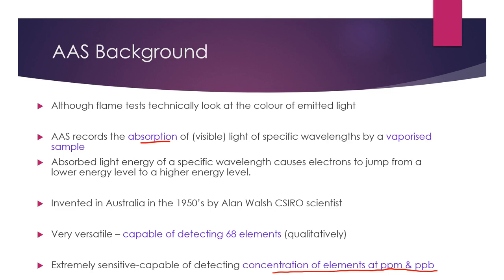Whereas where we looked at gravimetric analysis, you actually have to have a fair amount of the substance you're looking for in there to be able to form a precipitate. This would allow us to detect salts at a much lower concentration. So things like cadmium, which need to be present in 0.003% or things like that, we're going to be able to detect those at much lower levels using this technique.